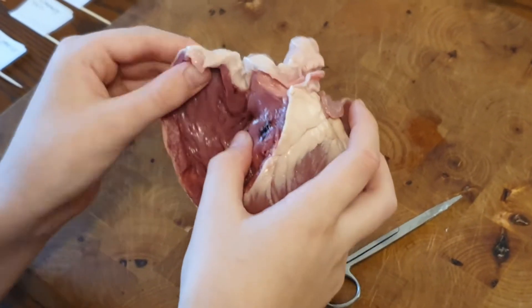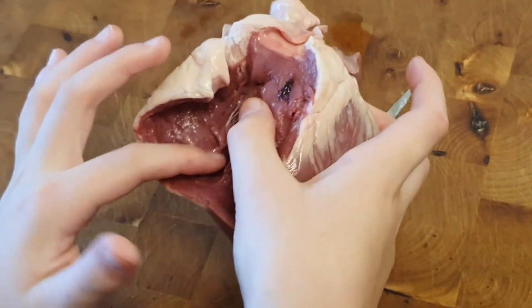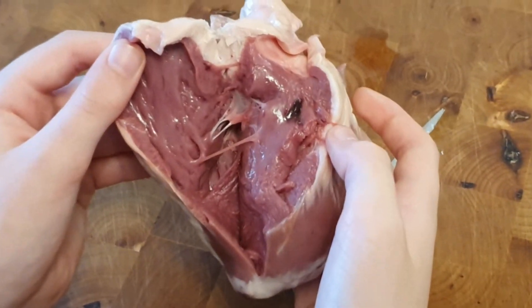We have cut some more and we have now opened up the next chamber called the ventricle. Can you move your thumb a second — the one that you're holding the heart with. That's it, fabulous.